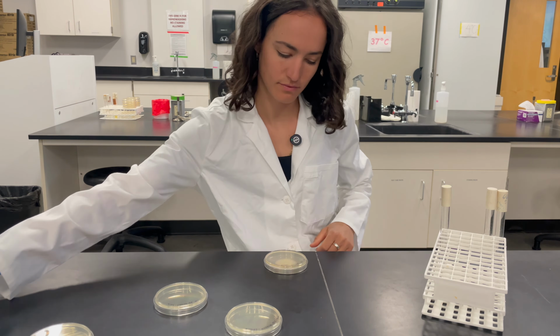Now it's time to prepare some slides so that we can take a look at these microbes under the microscope. Once again, we start by getting organized and labeling our slides. I add 1 drop of water to the slides so that when I grab some of the microbes off of the petri dish, they can then be suspended in this water droplet. And then I'll spread out the water droplets so that we have an even surface and a faster drying time. In this clip though, you'll notice I've placed 3 drops of DI water onto my slide. That's because I want to view 3 different colonies separately from the same hand sample. But I want to have them all on the same slide for easier viewing under the microscope.